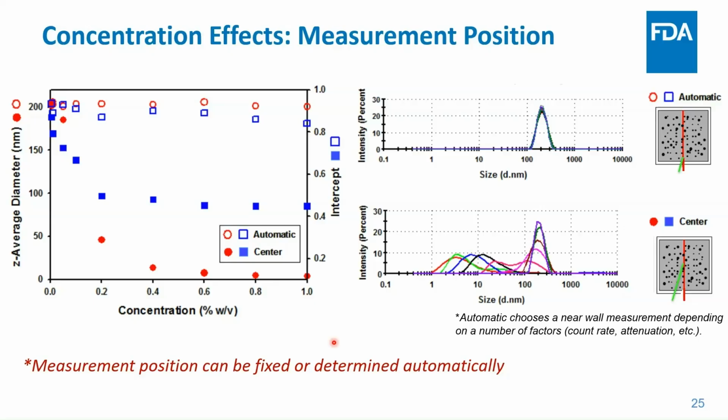And so that's an indicator. If the two things are supposed to be identical, it's better if they are measured in exactly identical conditions.